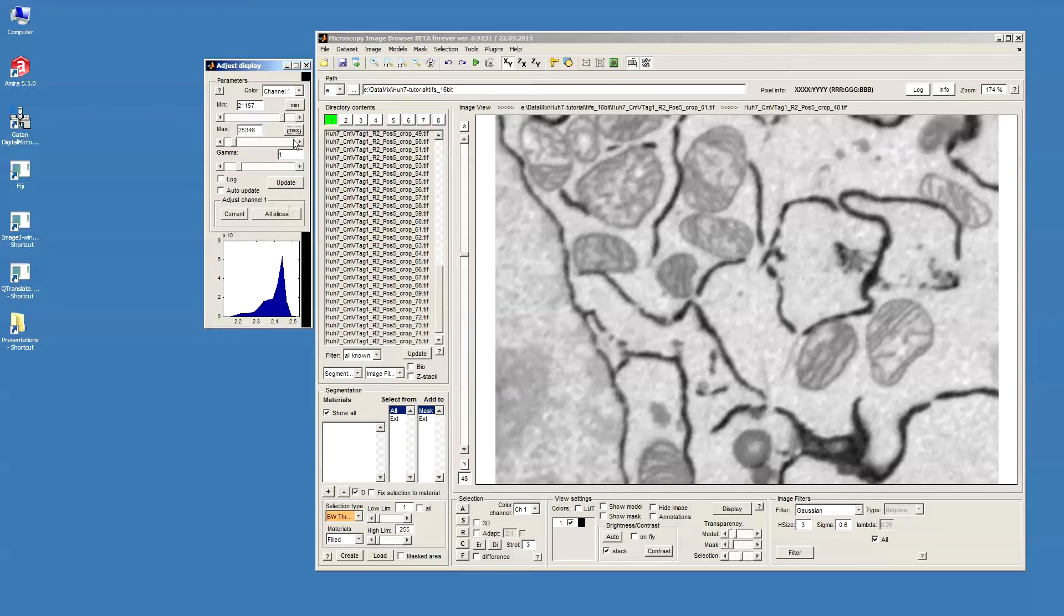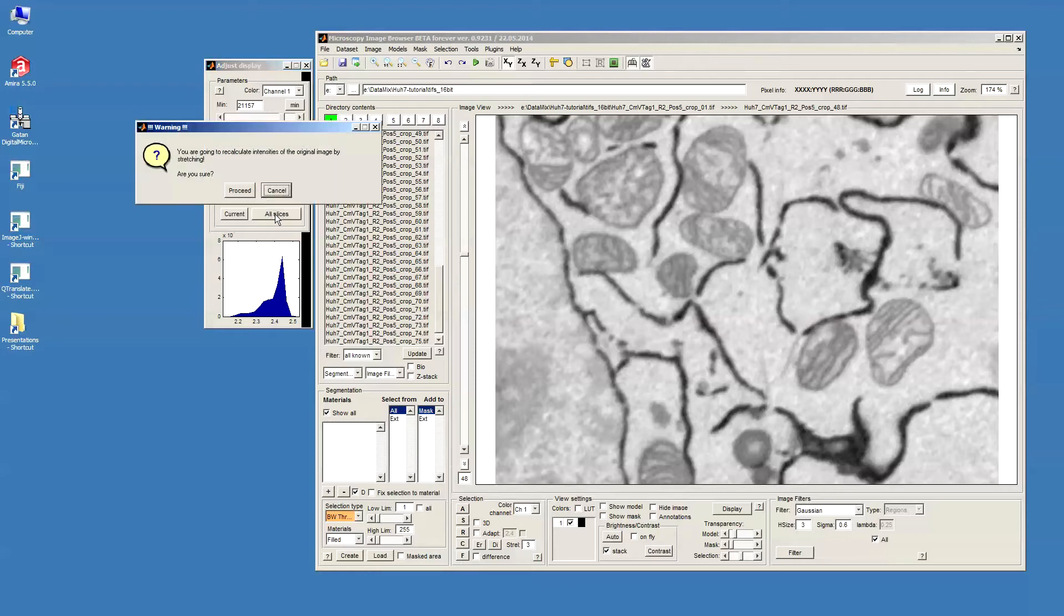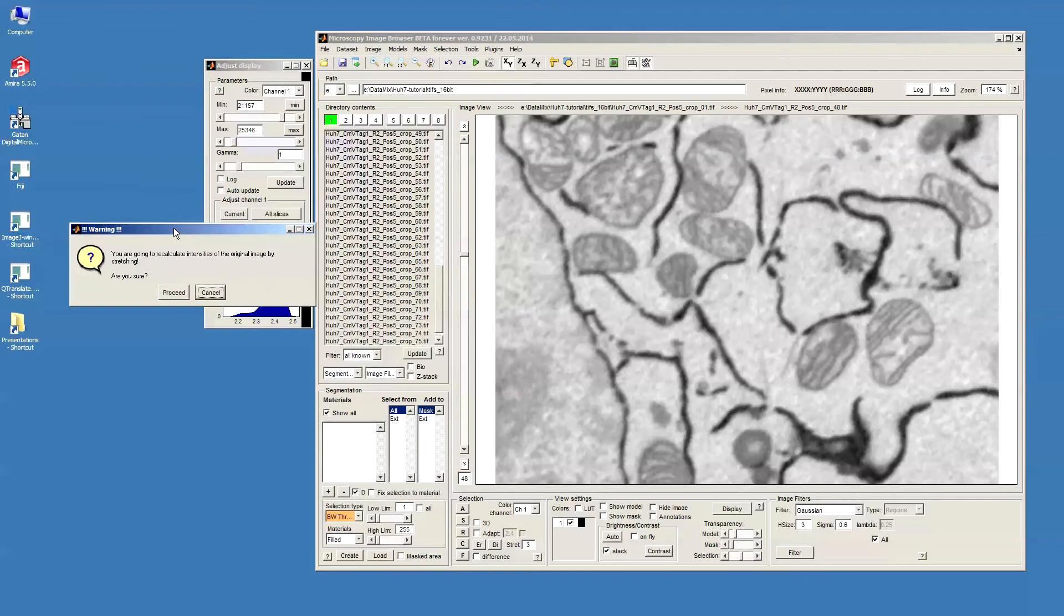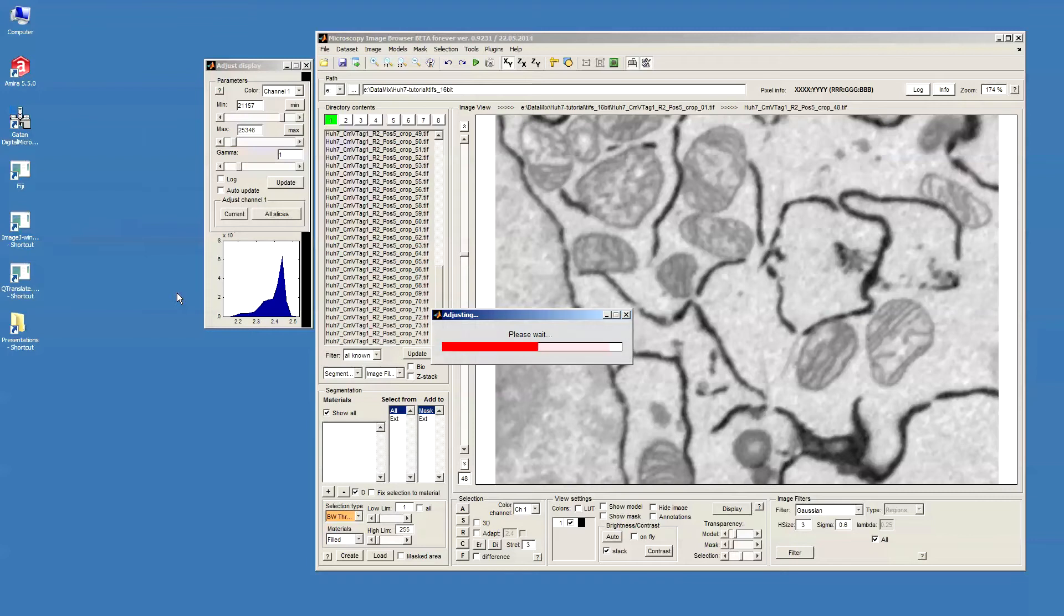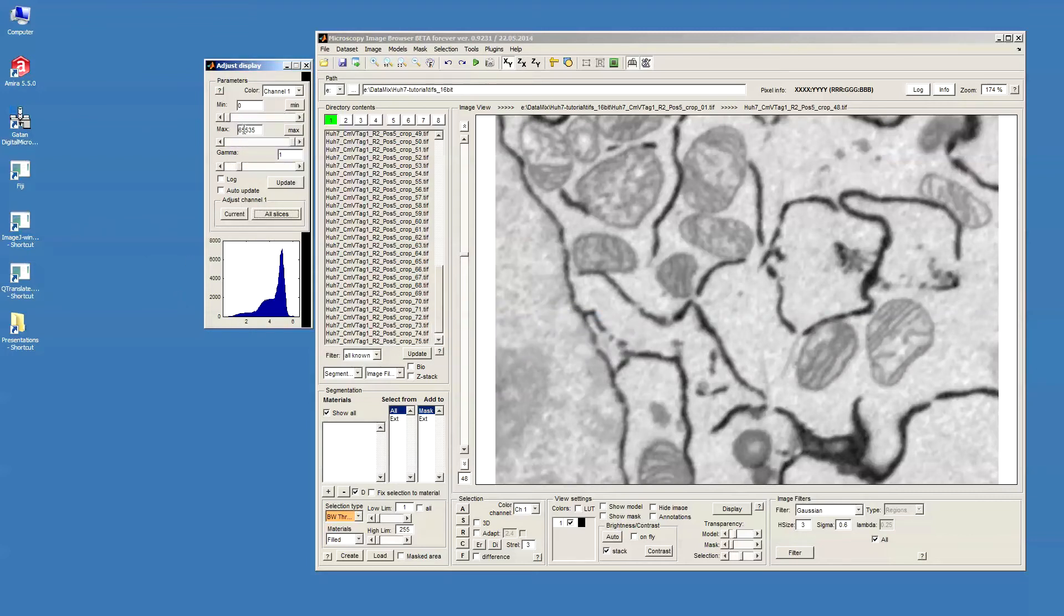In order to do that, I will recalculate the intensities by pressing this all slices, adjust channel 1 for all slices button. What will happen is the intensity which is now 21,000 becomes 0 and the intensity which is 25,000 becomes 65,000, as you can see now.